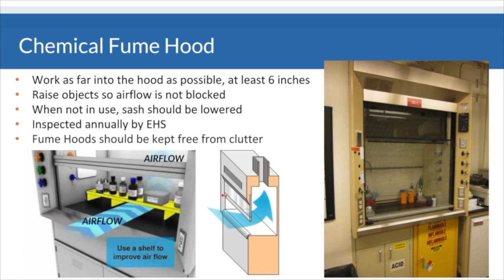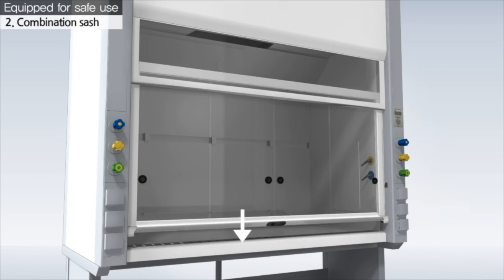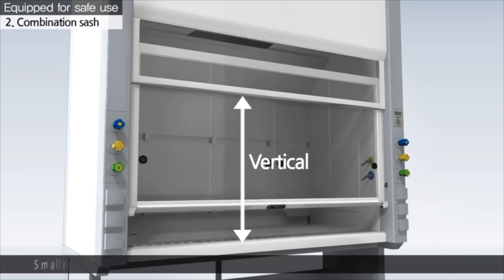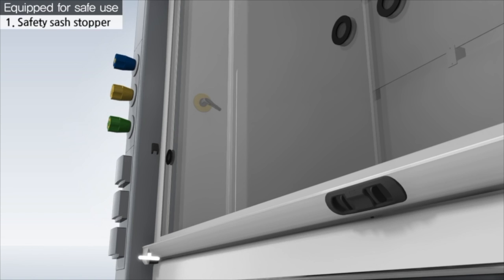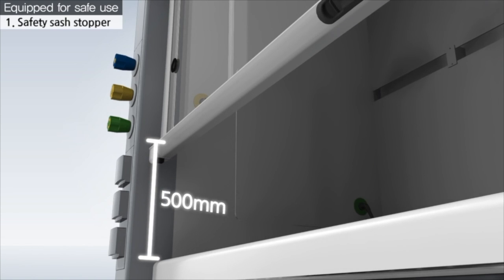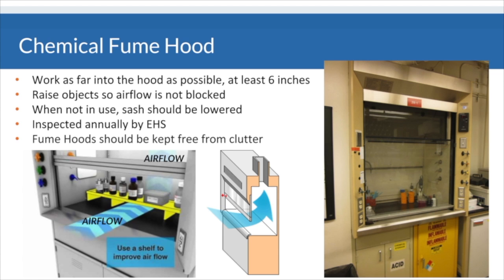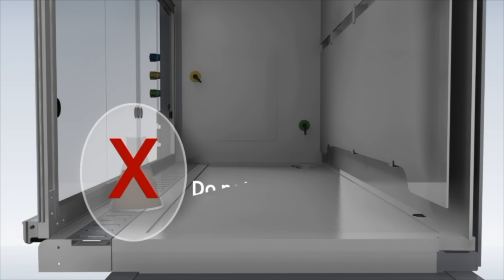The sash on a fume hood slides either vertically or horizontally and is designed to shield you from chemical splashes, flying debris, or inhalation of chemical vapors. Make sure you're working with the sash as low as possible and also work at least 6 to 8 inches inside the hood for your protection.